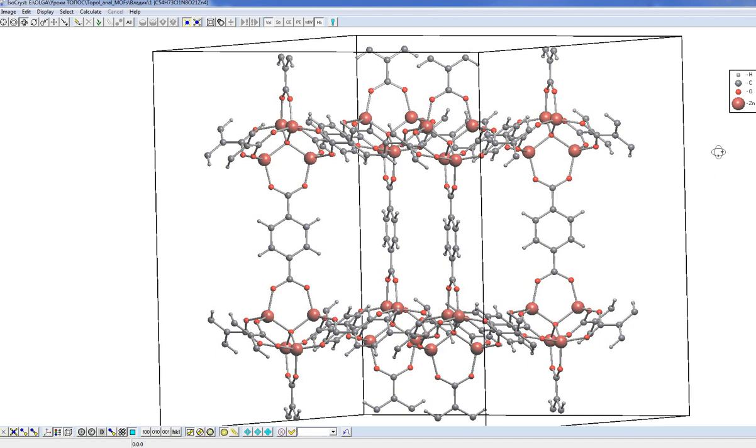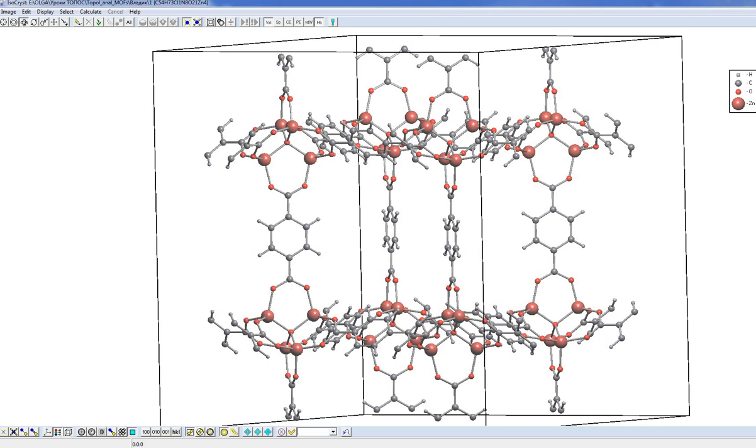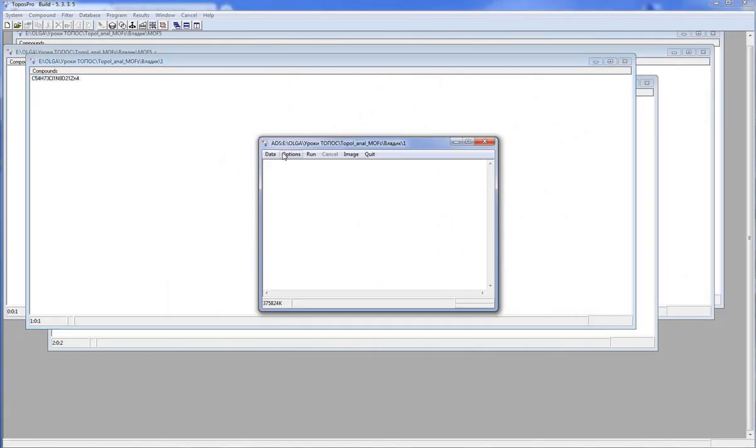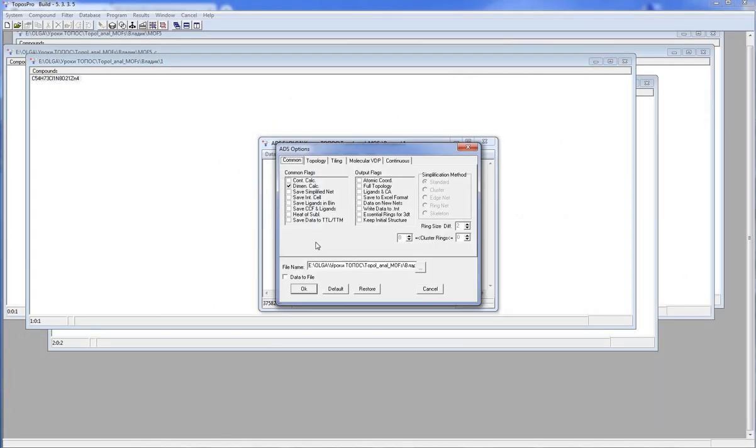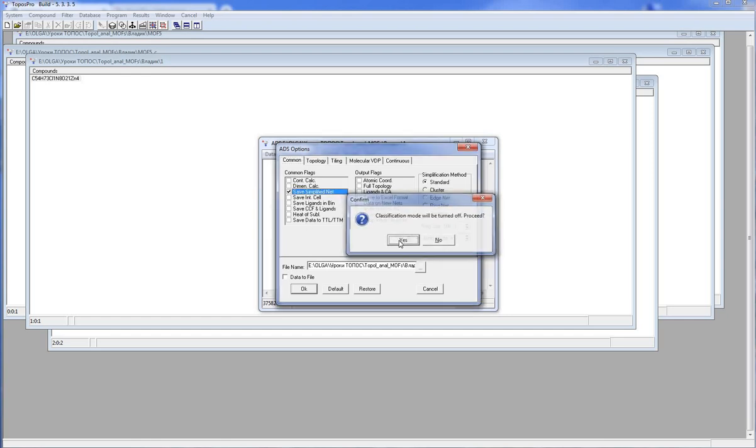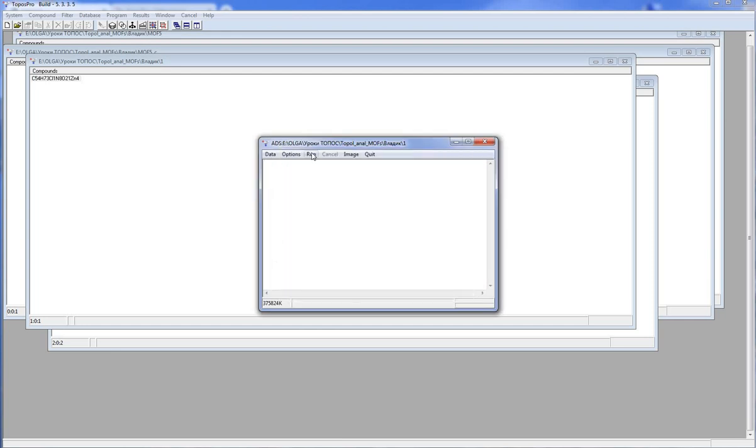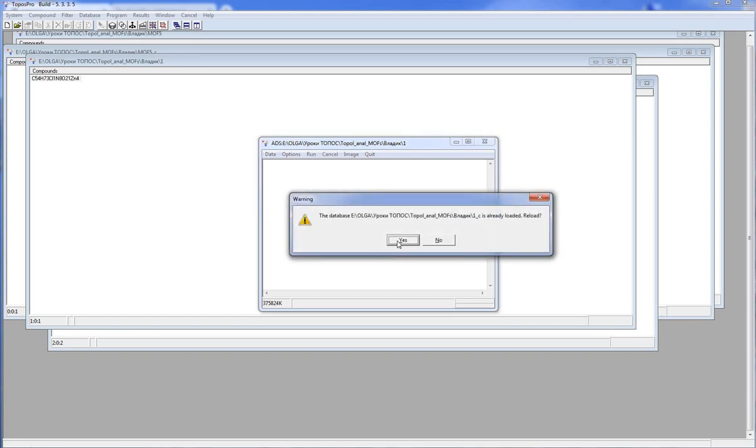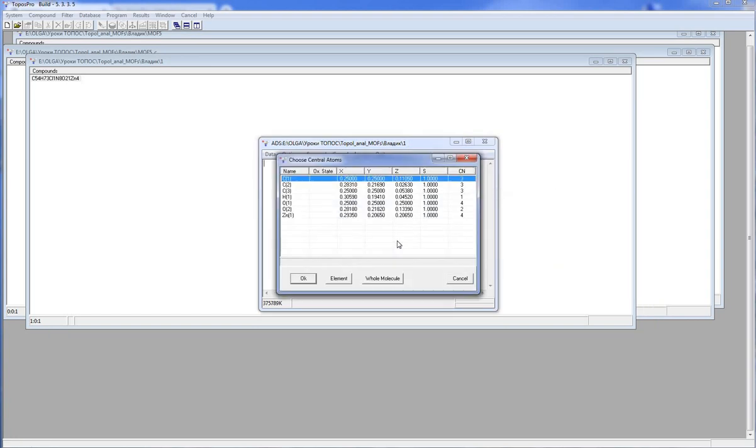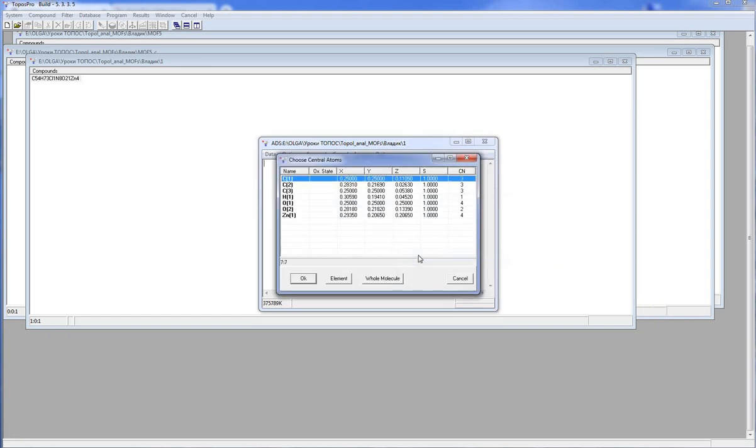To do the cluster simplification, I select the compound, run ADS, options tab command, check the option save simplified net and choose the cluster simplification method. Now I should select the central atoms. I select here all atoms because I do not know what structural groups are here. I just ask Topos Pro to find the structural groups for this network.